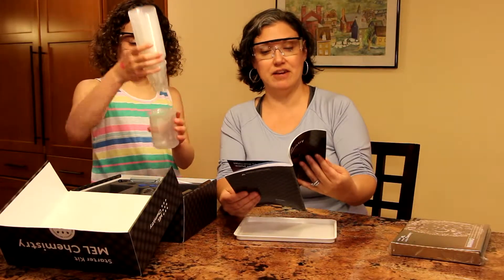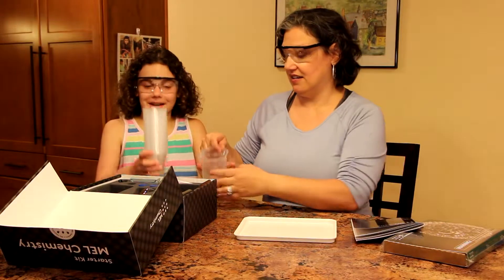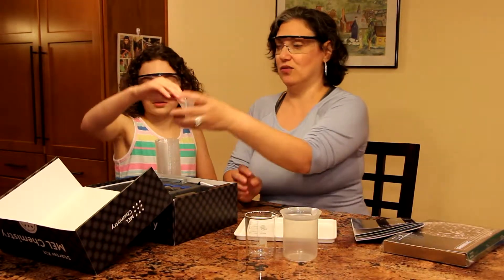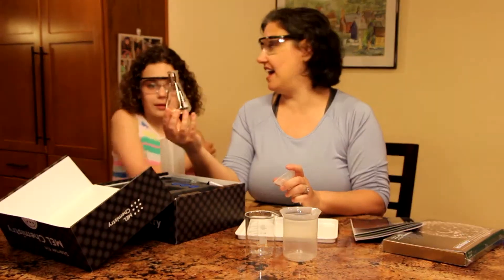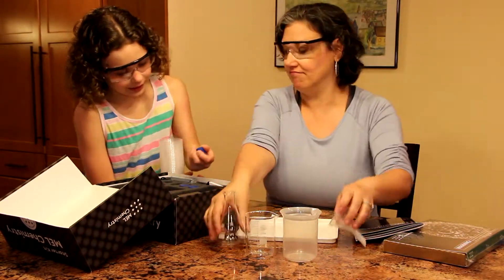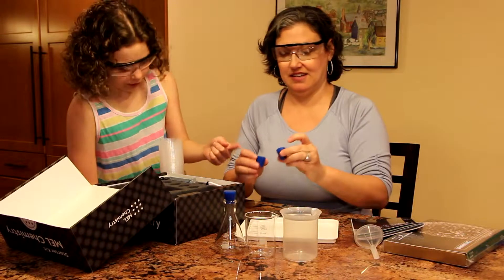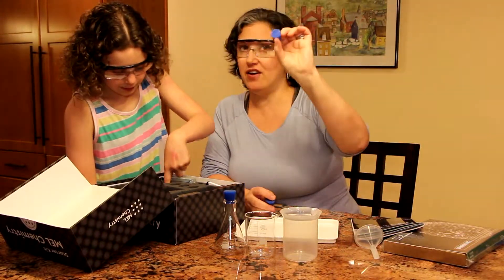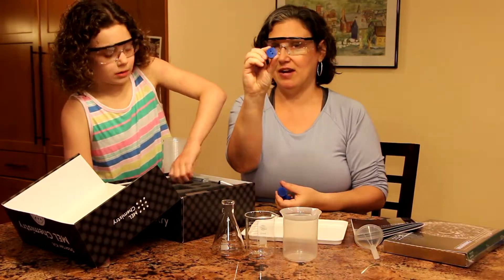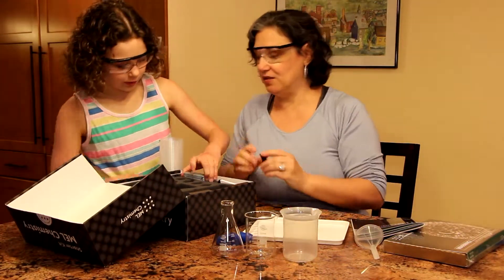It also has safety information and information for parents. Beakers and cups — because obviously you must have your beakers and cups. They have a plastic cup and a glass. A funnel. And this is a flask — an Erlenmeyer flask. And then of course you need your stoppers. This stopper has no holes in it, this one has one hole in it, and this one has two holes in it. So I'm assuming at some point we're going to have some tubes or something to put in there. And a little tiny funnel.